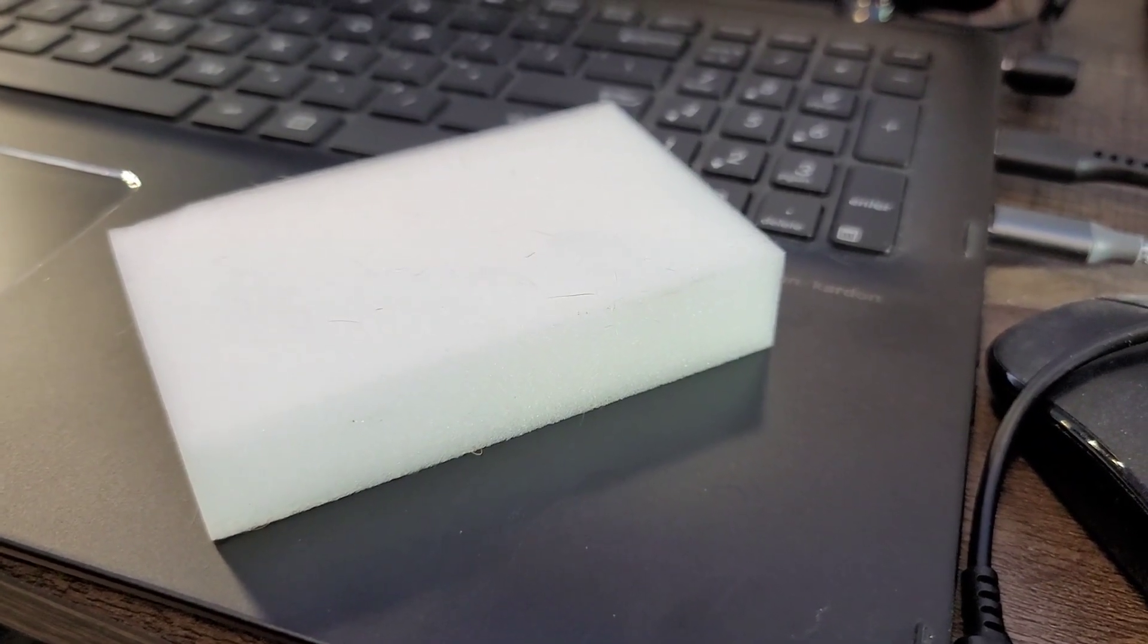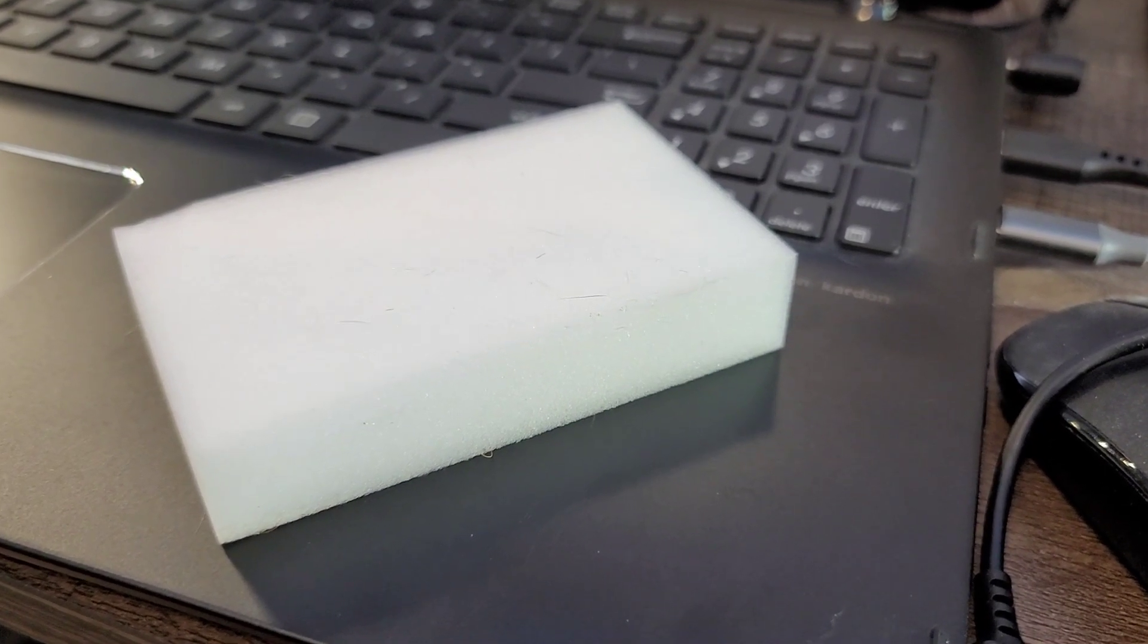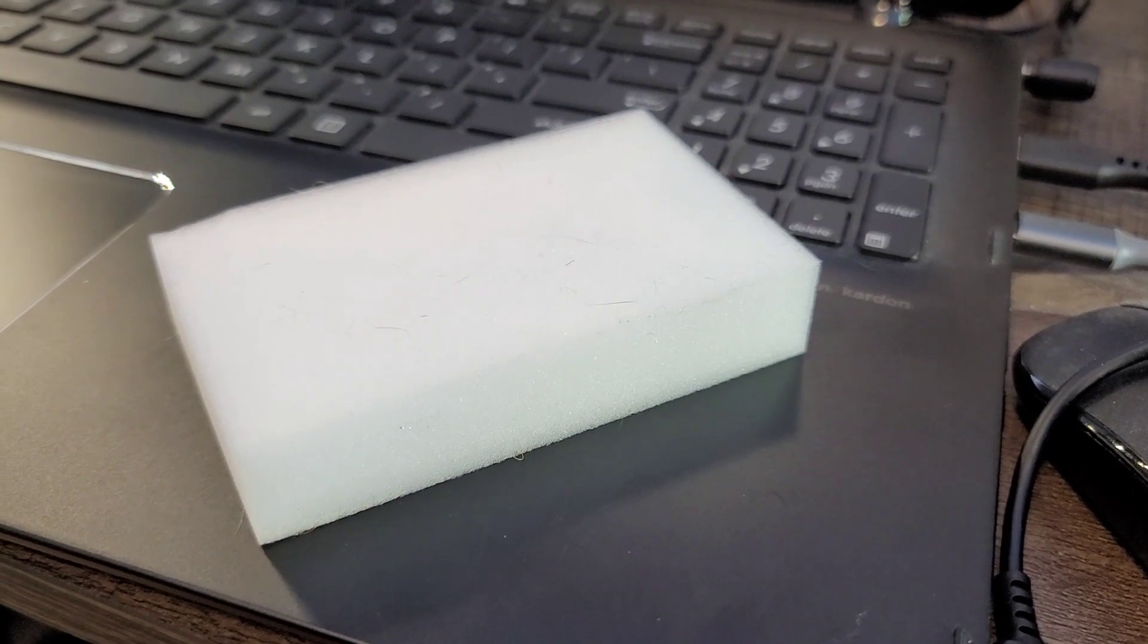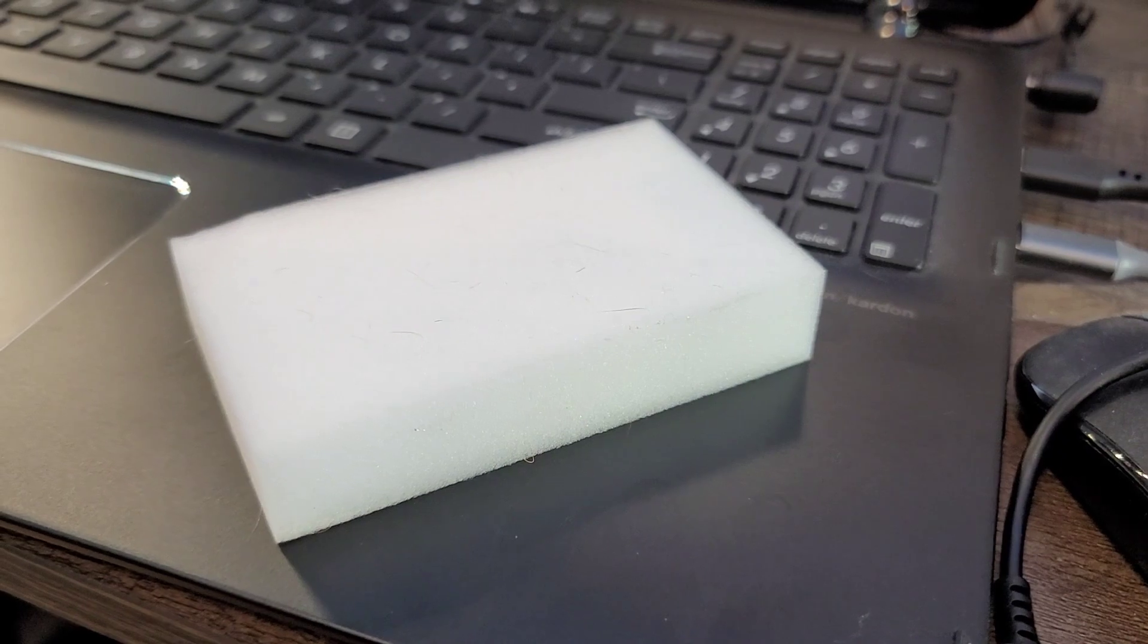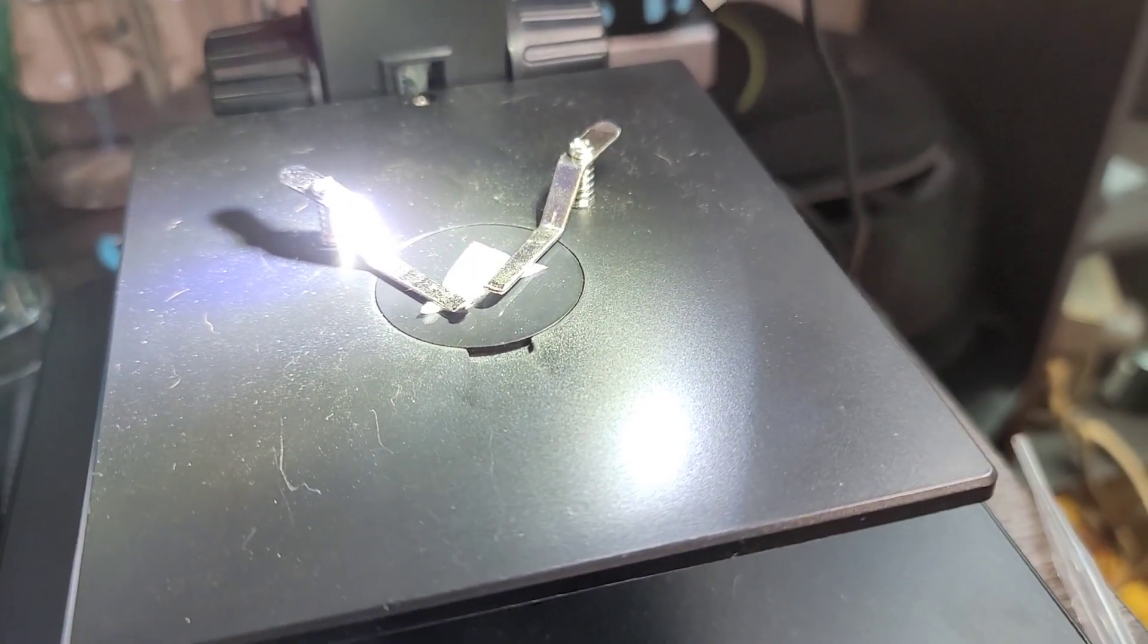We're going to take a quick look at a magic eraser under the microscope. It's also called melamine foam. I think I pronounced that right. Let's take a look at it under the microscope. So I cut a slice as thin as I could get it and we'll see how it looks.